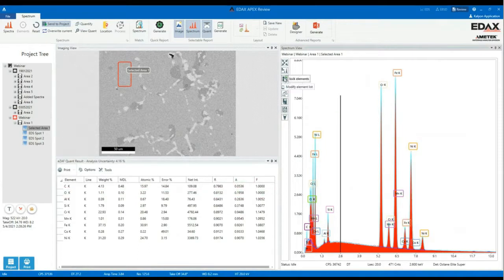By clicking on the third box, the window with the periodic table will open, and you can select elements from the periodic table. You also have the option in this hidden window to activate the elements you want to use for the quantification. This means if you do not quantify manganese and iron in your sample, then you can disable the two elements, click on OK, and you will get rid of them in the quantification.